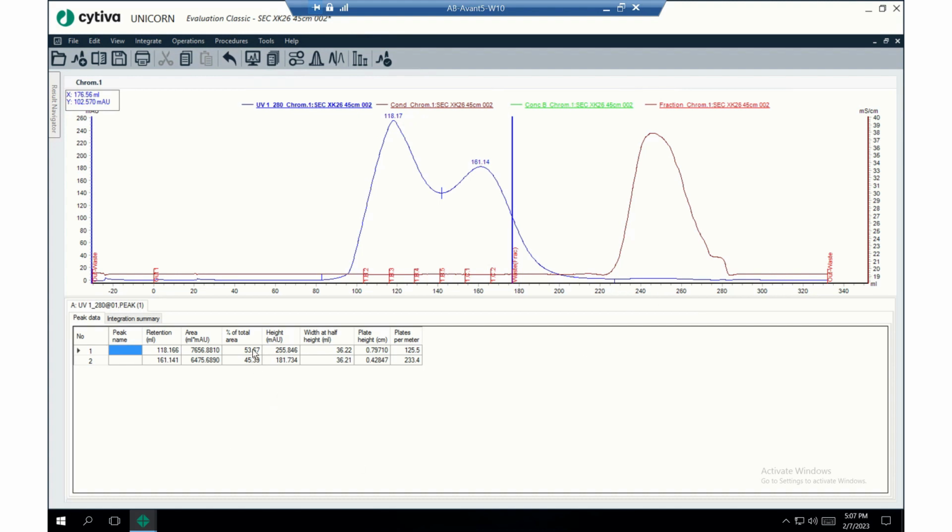So this area of 53% and 45% isn't accurate, at least not accurate to what I want to show. So I have to make more adjustments. So I can make those adjustments. So it's 176 to 82. Okay, I'm going to remember that.